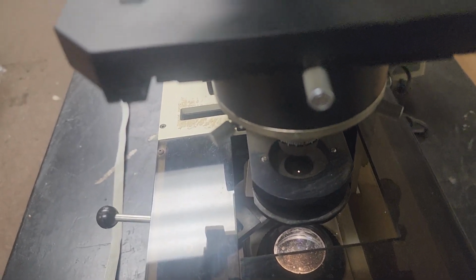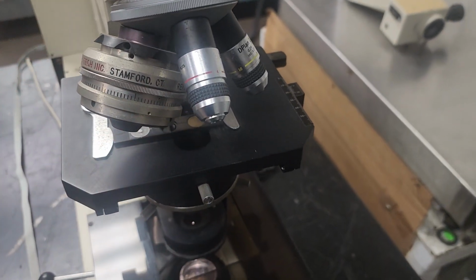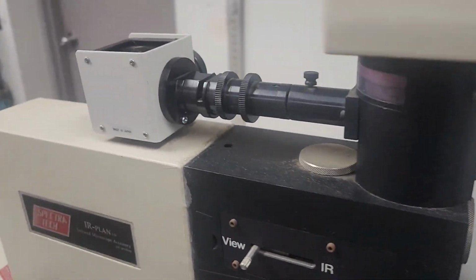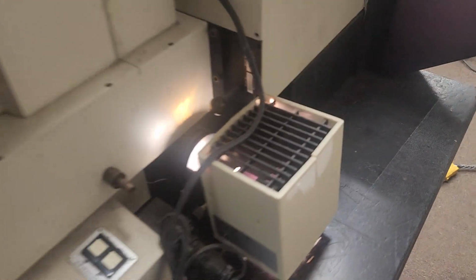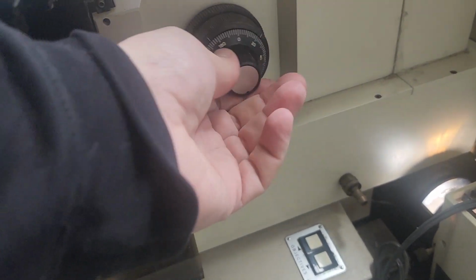I cannot really get the light. I can kind of see it through my viewfinders, but I don't know how to set this up so that I can see it. As far as the infrared portion of it, I don't know whether it has something to do with this piece that doesn't seem to be doing anything or modifying anything. But this is all lit up. You can see that. And the adjustment here.